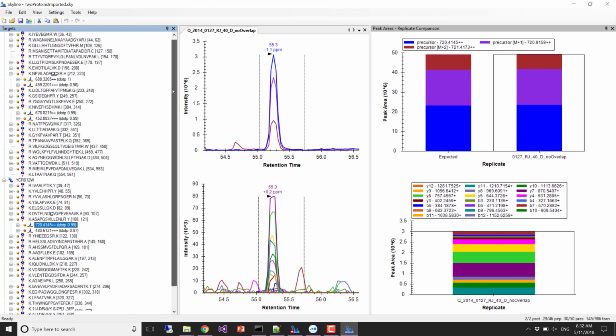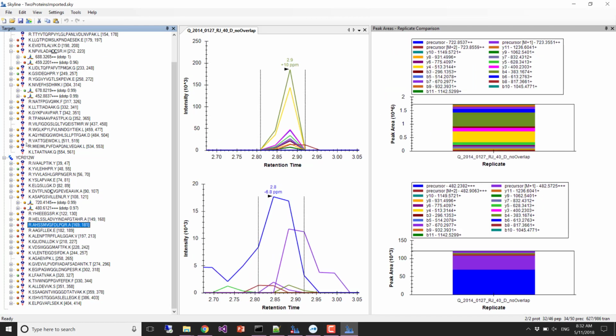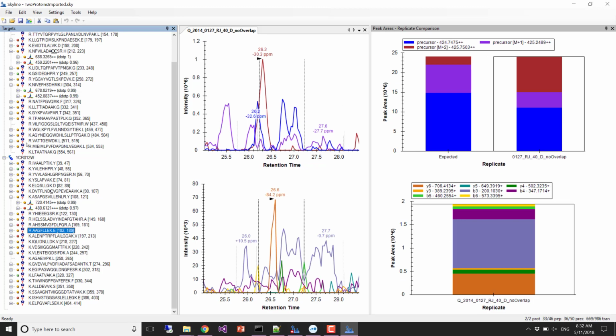and I think for these two proteins, we probably could come up with enough peptides that measure them pretty well that we would be fine. But let's look at how, so we've already started venturing into iRT and retention time normalization and much larger data sets. But let's take the next step into, there's a fairly easy way. If you just did some DDA measurements, even if you didn't have iRTs, if they were done on the same system, then they probably have very similar retention times.